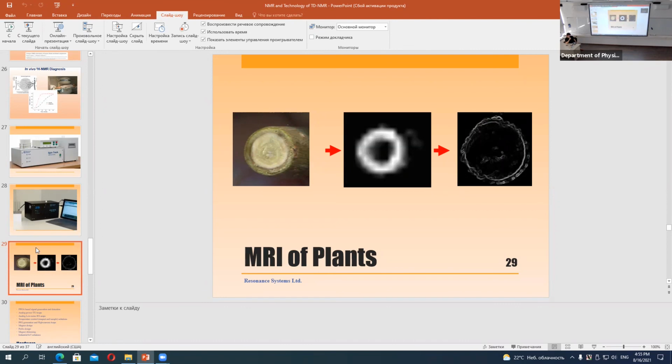so many 1.5 Tesla or 3 Tesla machines now. The people who work in the market, this medical staff, normally don't know the basics of MRI. They know just the applications. That will be a great problem, to educate these medical staff to work correctly with 0.5 Tesla. So the question was below 0.5. If you go below 0.5, this is already a problem.